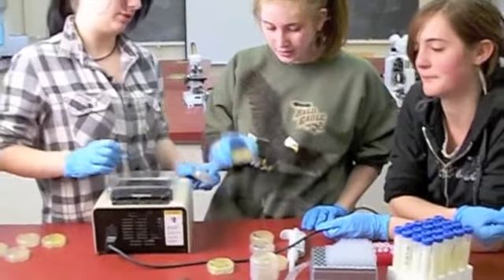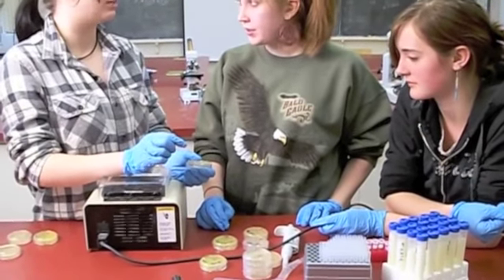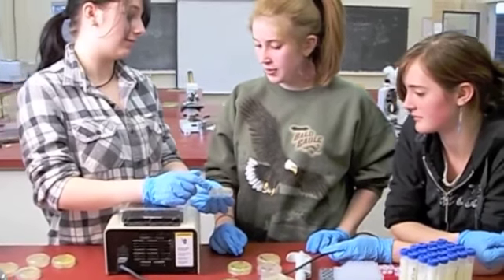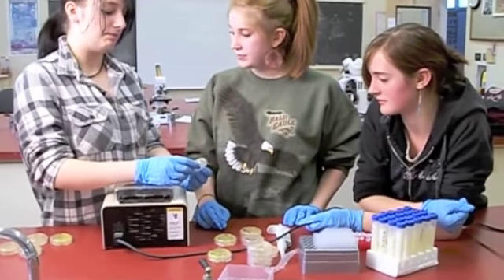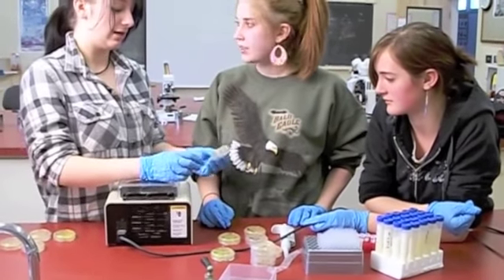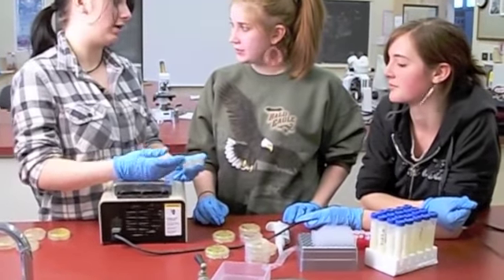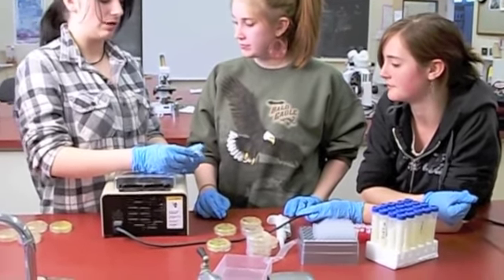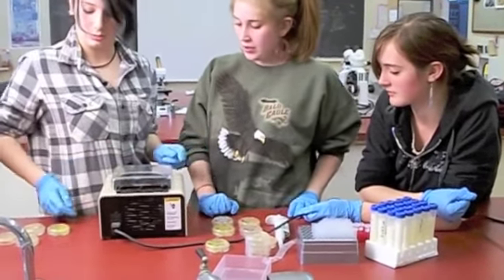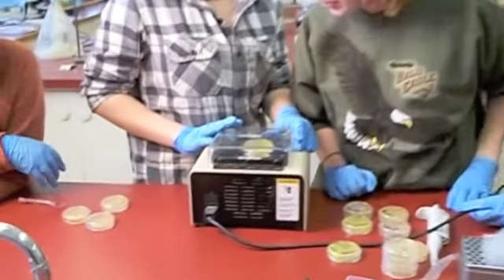These plates are also loaded with ampicillin. So if the cells don't pick up the plasmid, they die, because the plasmid also codes for ampicillin resistance. So basically, all these cells have died. But if they didn't die, we would know that the cells were already resistant when we grew them, or they mutated a resistance, which is why we do all 4 of these plates and not just the one we want to look at, which happens to be kind of cool.